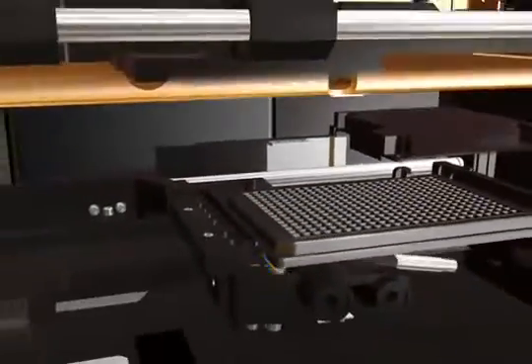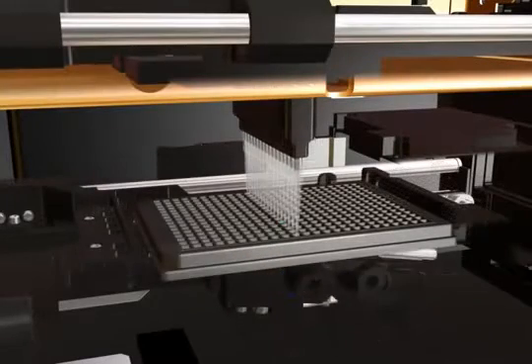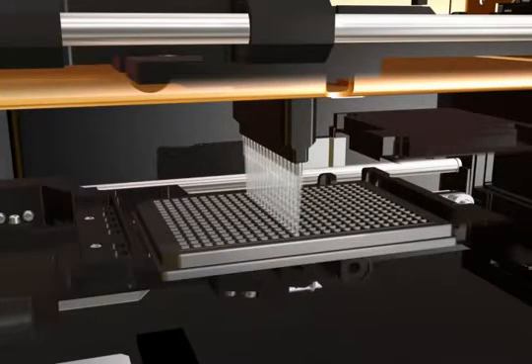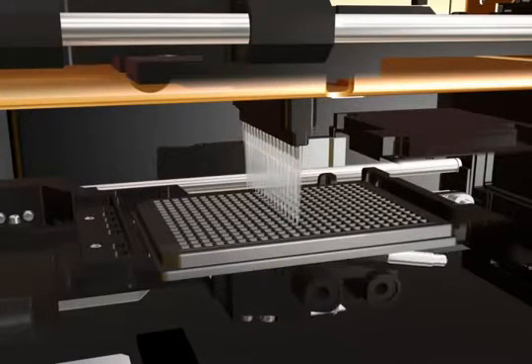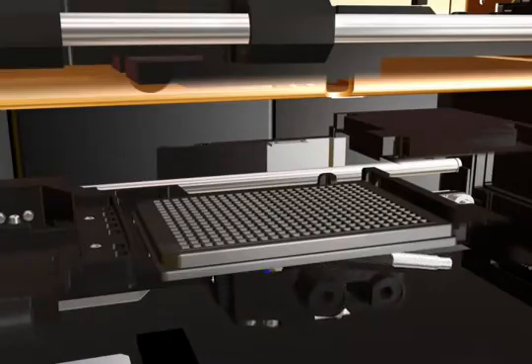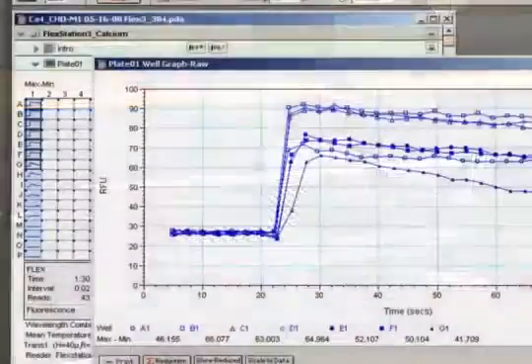With FlexRead, throughput is increased compared to single injector systems because an entire column of wells is pipetted, read, and analyzed together.